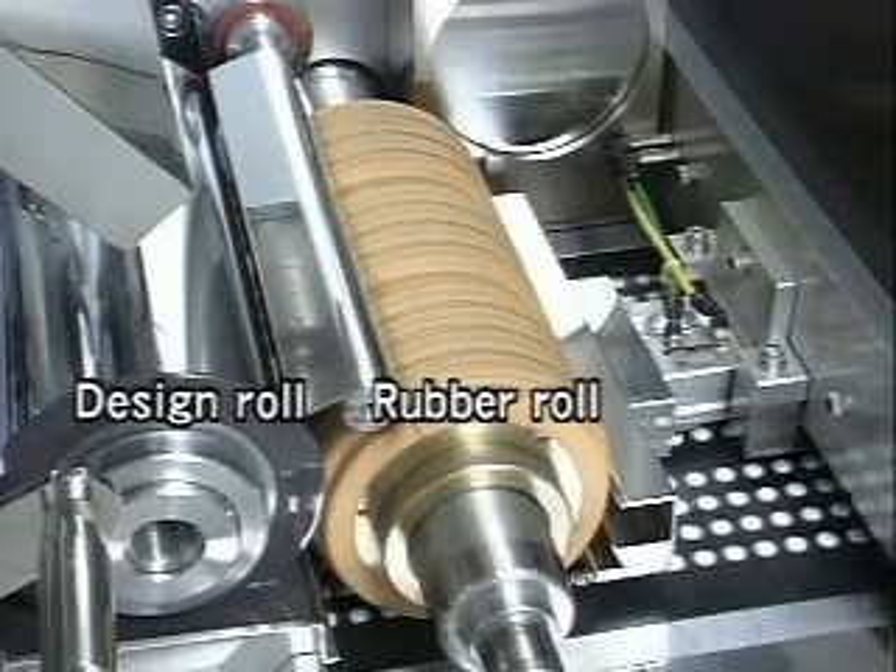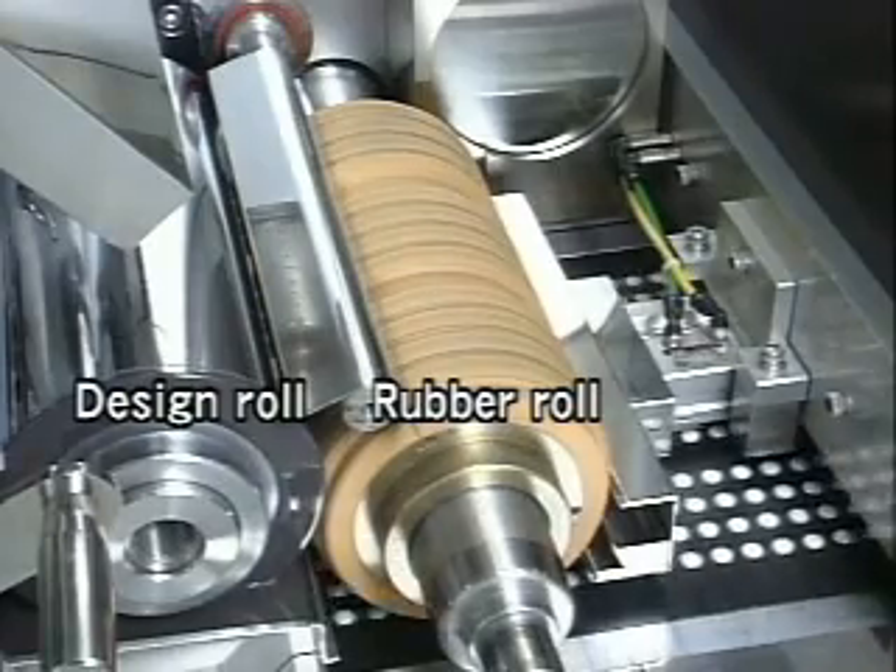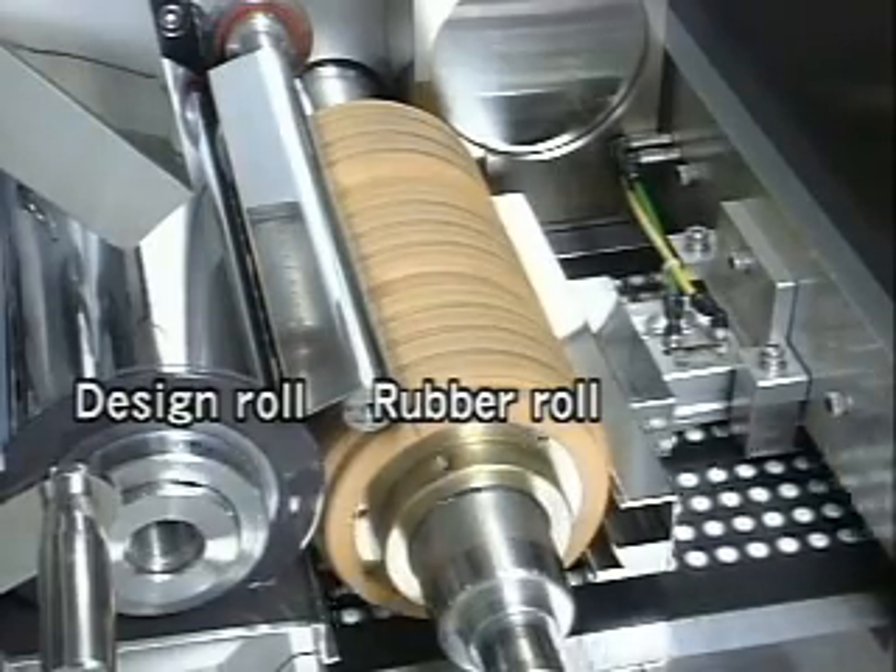After being transcribed to the rubber roll from the etched design roll, the letters and marks are printed in the correct position on the tablet's surface.